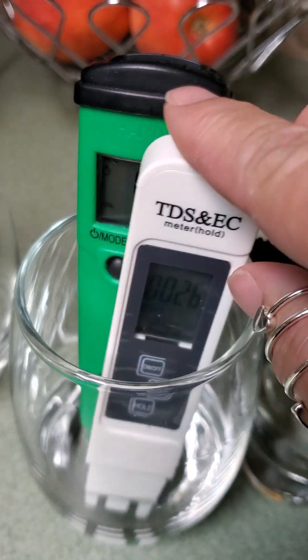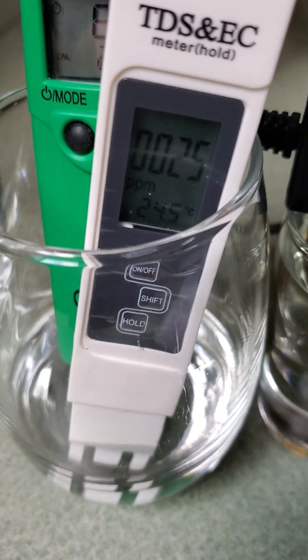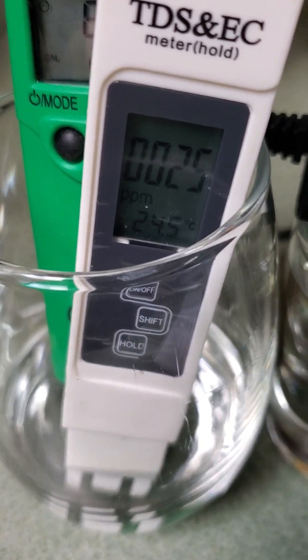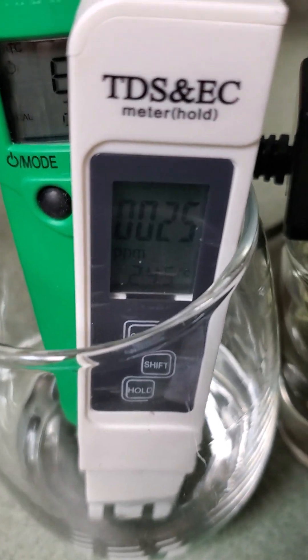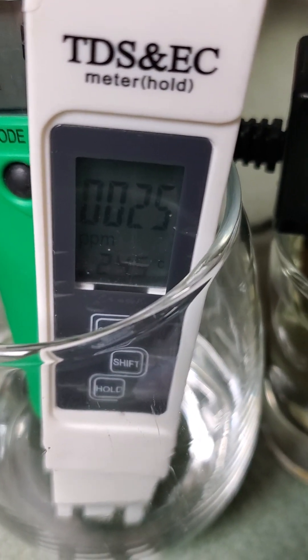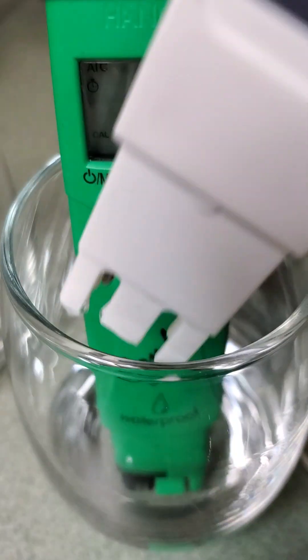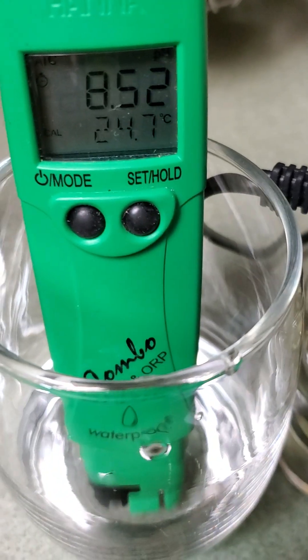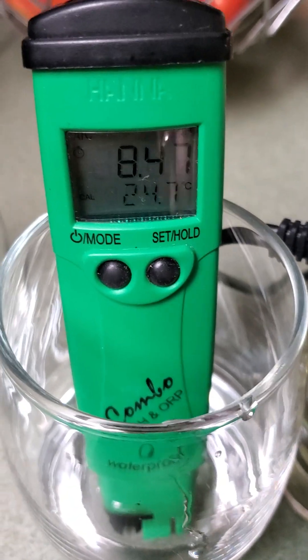Total dissolved solids measures exactly how many solids are in the water. If it's less than 120 you can estimate it's gone through a reverse osmosis process. We're at 25 for total dissolved solids, which means they've removed almost everything — that's pretty standard, pretty solid. pH is coming in at 8.49 at about the one-minute mark.